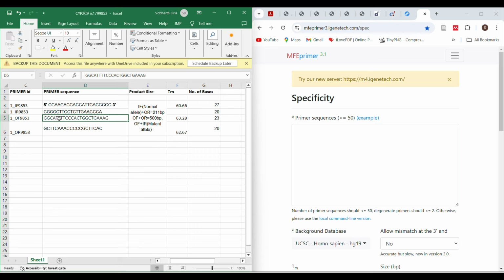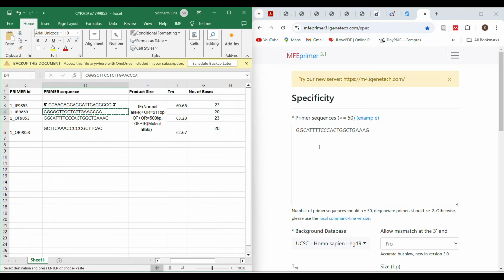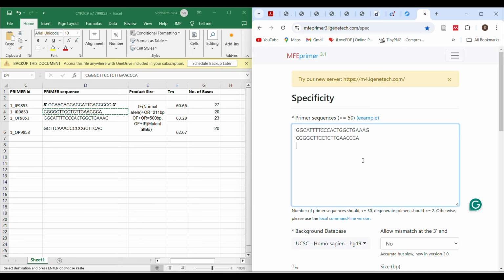So till now this is clear, I hope. So Control C, same way I paste it here, and below that I want to add IR. So this is my IR. Now there is one thing to be noted here: whenever you are checking your IR, this is reverse, right?